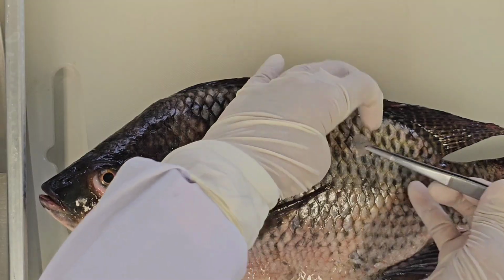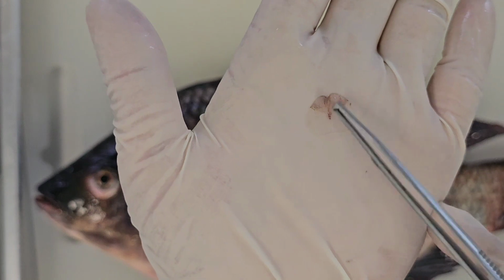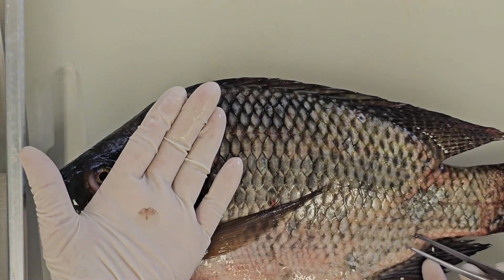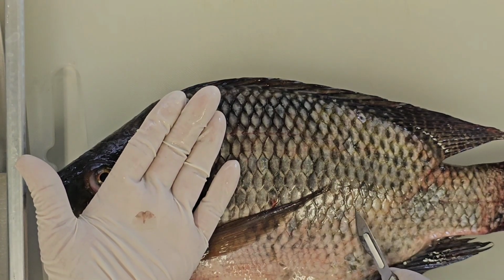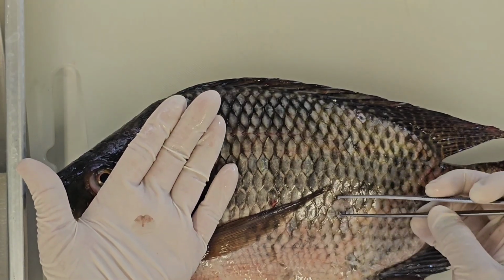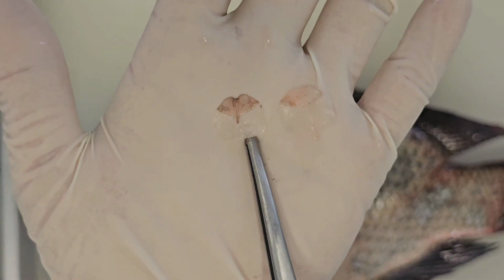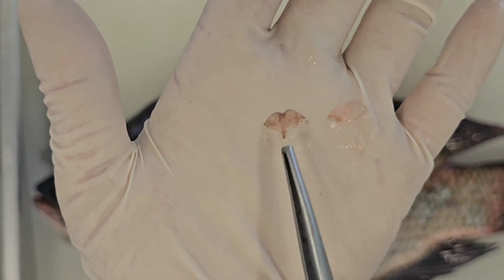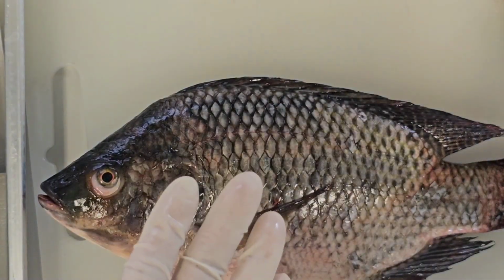If you see the structure of the scale from the lateral line, you can see in the middle it will have a hole inside. And if you compare the scale at the lateral line with the scale at the other part, you can see the difference, right? So the lateral line has the hole and the other part doesn't have the hole. Okay, so inside this one it will have the organ that is used for sensing waves.